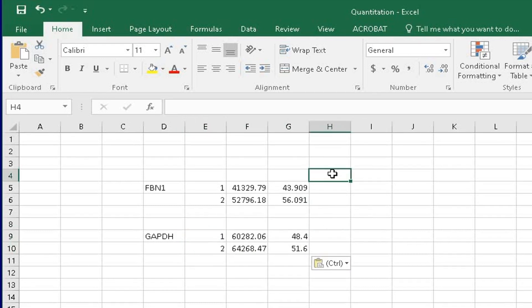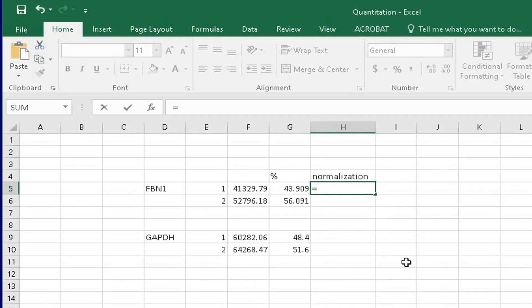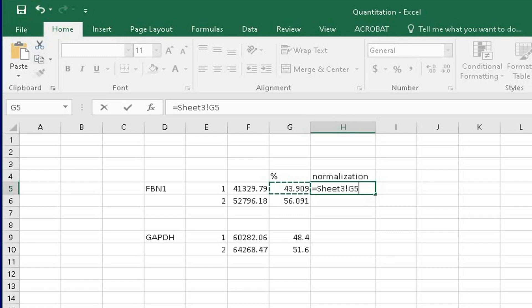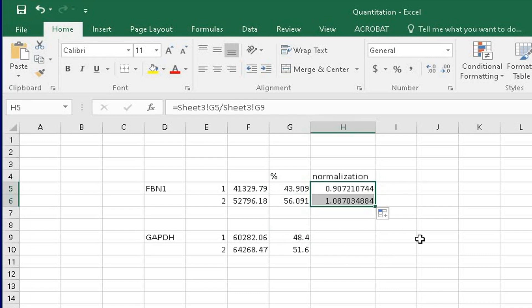To quantify the intensity, let's calculate the normalization values. This is achieved using the formula equals and then click on the percentage area intensity obtained for the first band from the blot over its corresponding GAPDH percentage and then hit enter. The other band intensity can be calculated similarly.